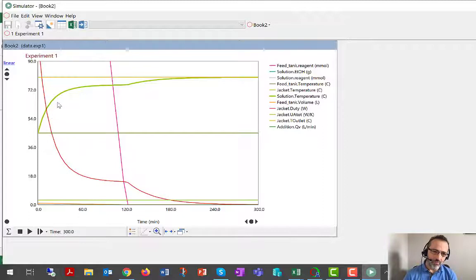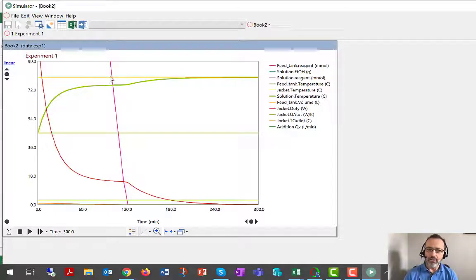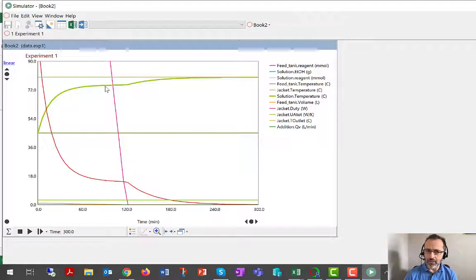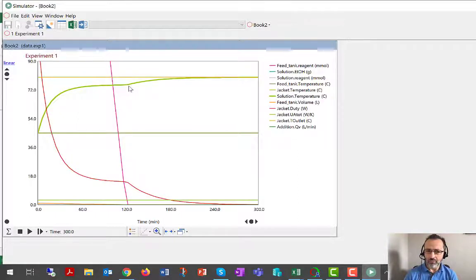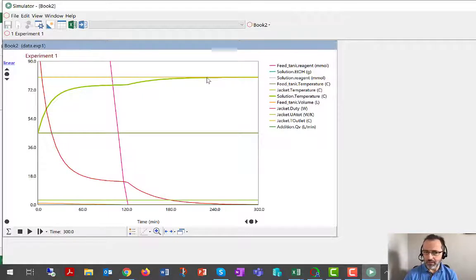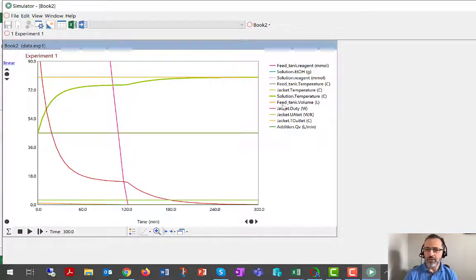Solution temperature has a slightly more interesting trajectory now. We're getting the batch up near 80 degrees C, but then we can't quite get there. And the reason we can't quite get there is because we're adding cold material from the feed tank. So it's only once the addition is complete that we're actually able to get to the 80 degrees. So that's the sensible heat of addition.